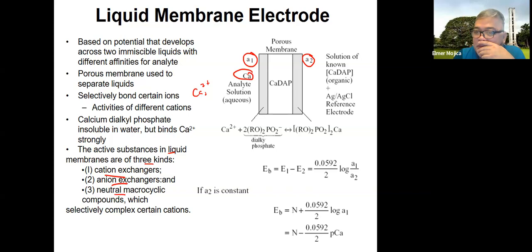If you read what you're assigned to write, the principle, I think, is still the same here. This is the so-called modifier in a potentiometric method. You find a way wherein you have a material that binds with your target cation. In this case, it can be a cation exchanger or an ion exchanger.